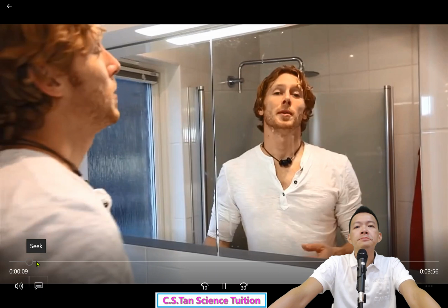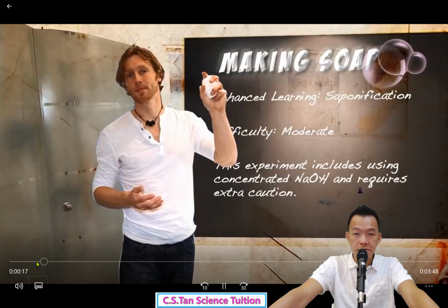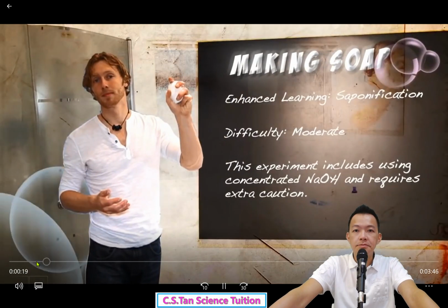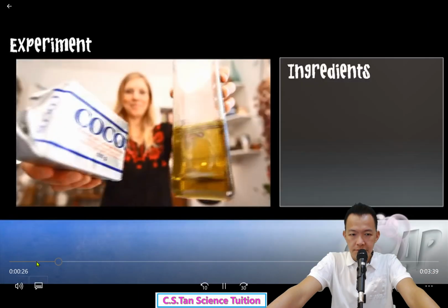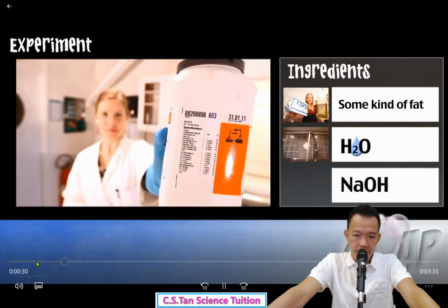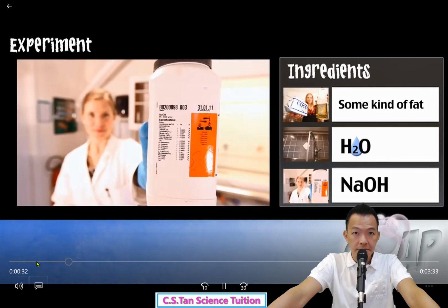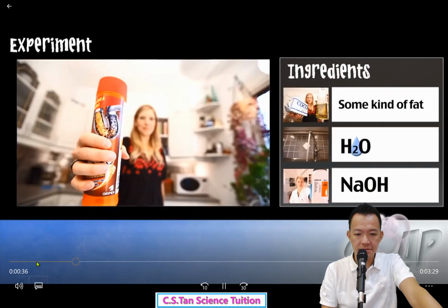Hi, the experiment we're going to do today is not a new one. In fact, it's about 4,000 years old and it can be related back to health. We're going to make soap. Before we start the experiment, let's look at what we need. We need some kind of fat, tap water, and sodium hydroxide. One common use for sodium hydroxide is in drain cleaners, so that's what we will use for our experiment.